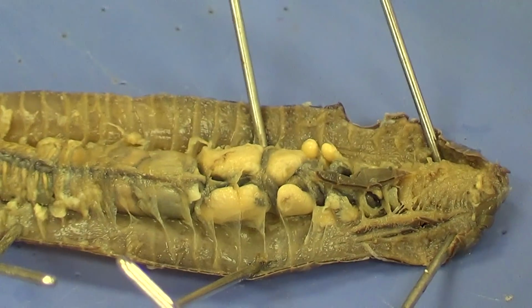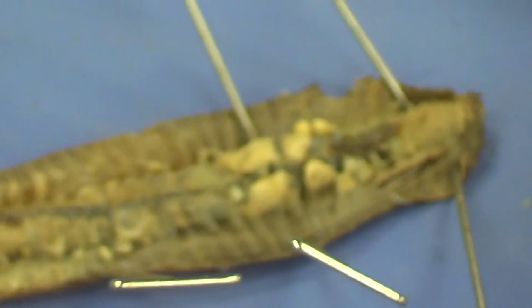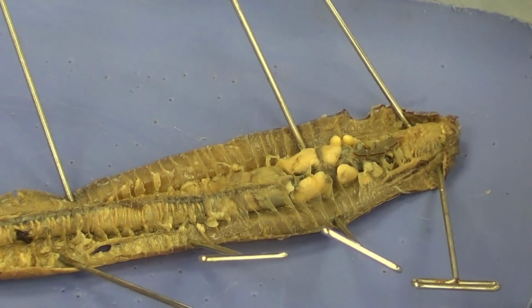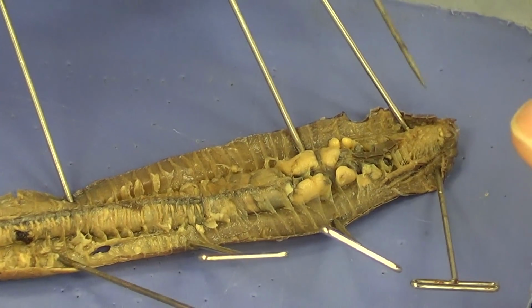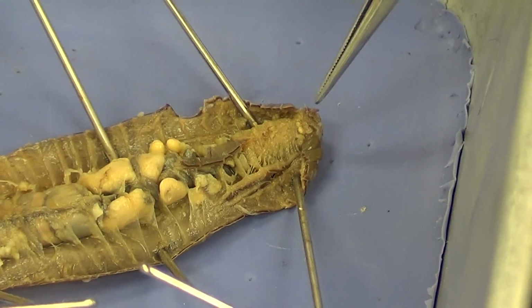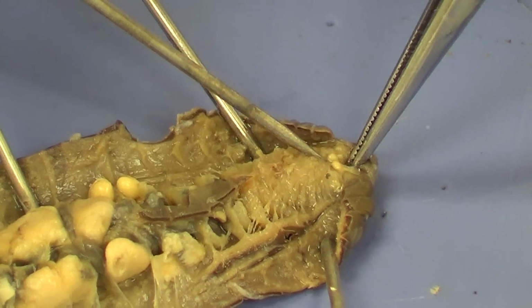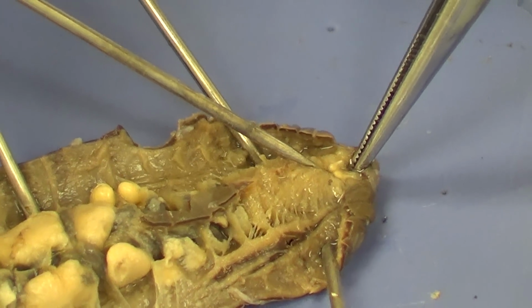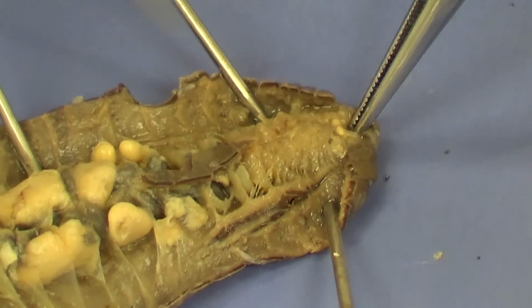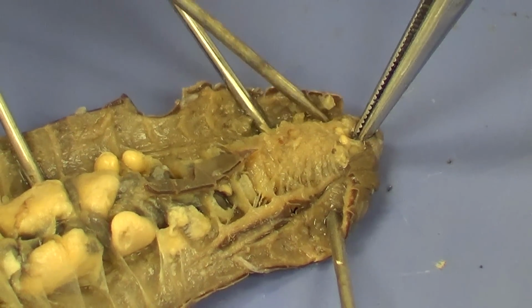And there we are. We've dissected our earthworm, and now all that remains to do is to go over some of the anatomical parts. The first thing I want to show you here, in case it gets destroyed, you can see these white structures right here. I'm going to try to hold this down just a little bit. Maybe we can get a close-up shot of this. And you can see the two little white structures right there at the tip of the pin. Those two white structures are the brain. Eventually the nerve cord ends in those two white structures. That is the brain of the earthworm there, not quite as big as yours.